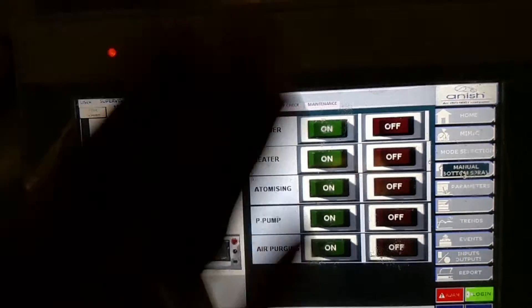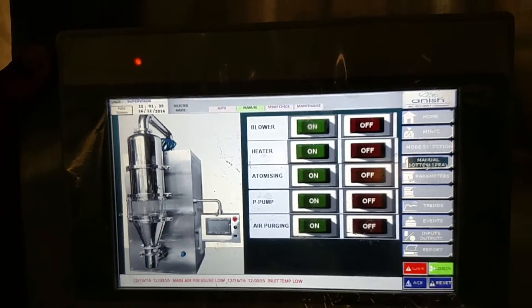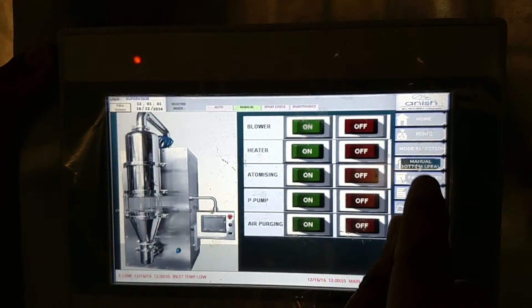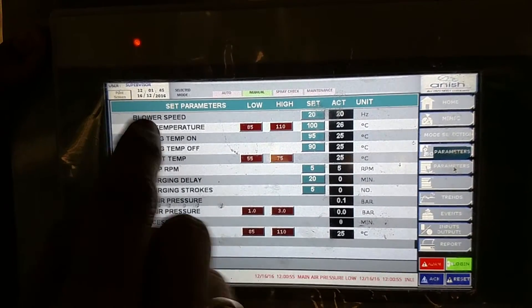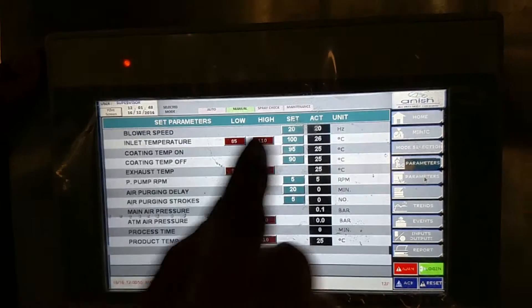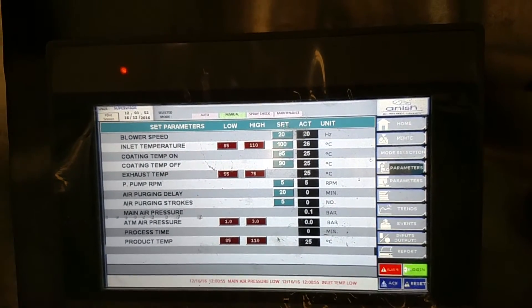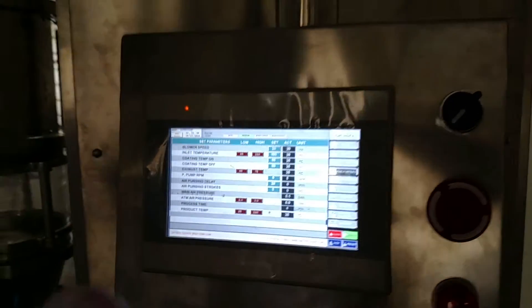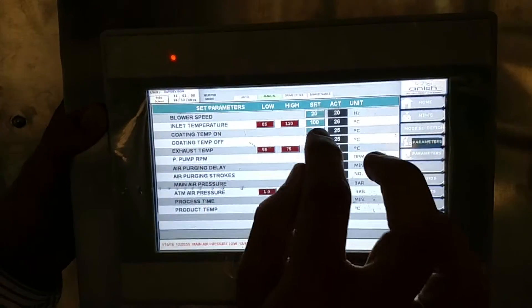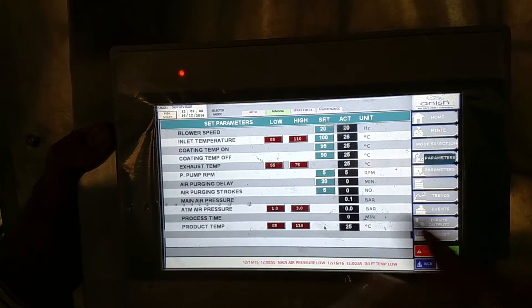Now the system is complete — blower and heater. We have to set the parameters on which we want to run our equipment. We will go to parameters. Blower speed is set to 20. Inlet temperature is set to 100. Coating temperature on is 95, and coating temperature off is 90. We can set it to any value that we want; here we have set it to 90.